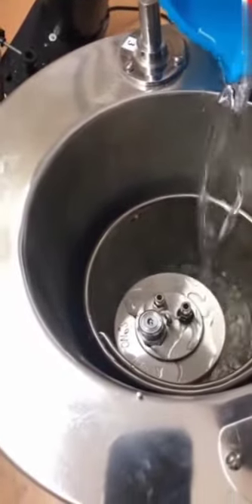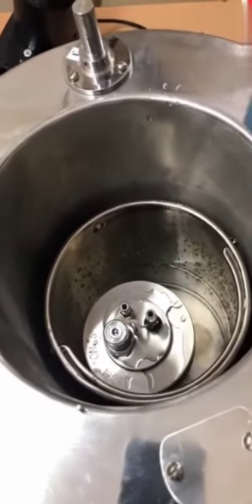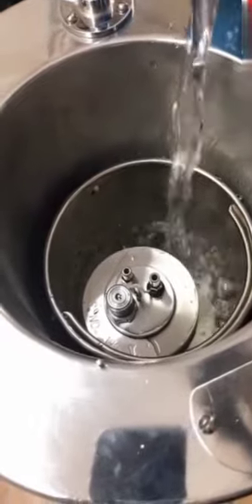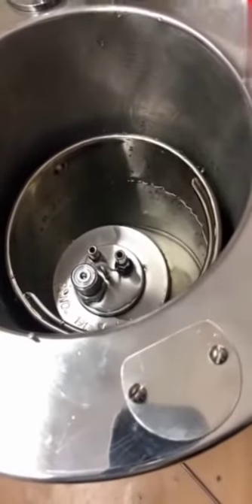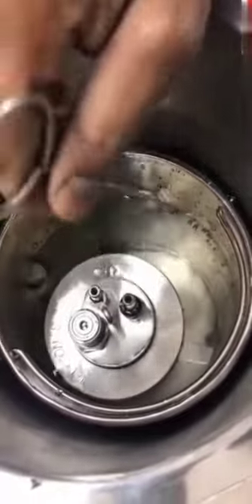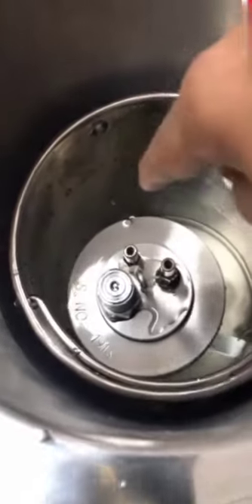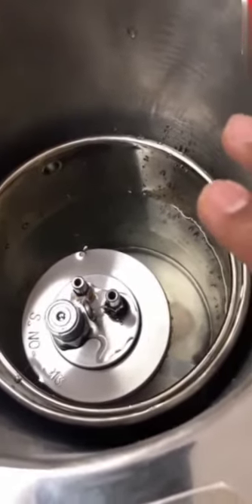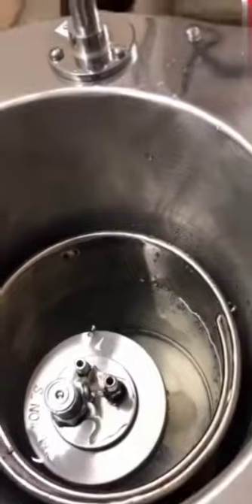We have to use distilled water only, and this water has to be changed every time for testing. The quantity of water should remain constant for every single test. The water level should touch the serial number marked on the bomb — this is the local reference. The best way: after testing, measure this water, and suppose if it is 1800 or 1850 or whatever, make a note of it and use always that same quantity of water every time.